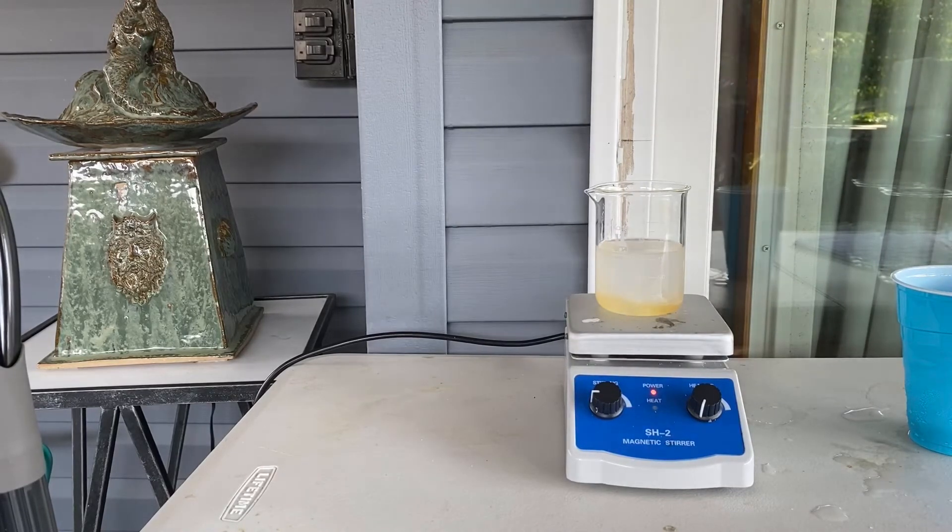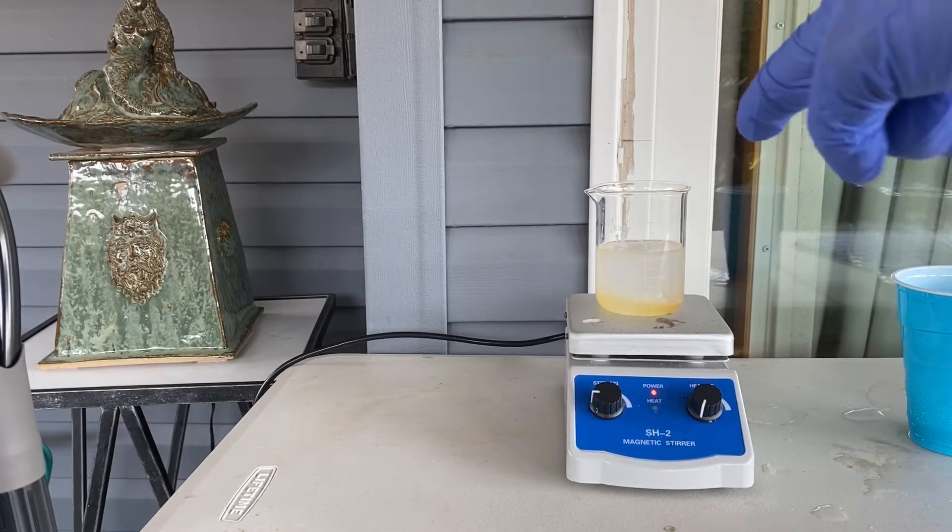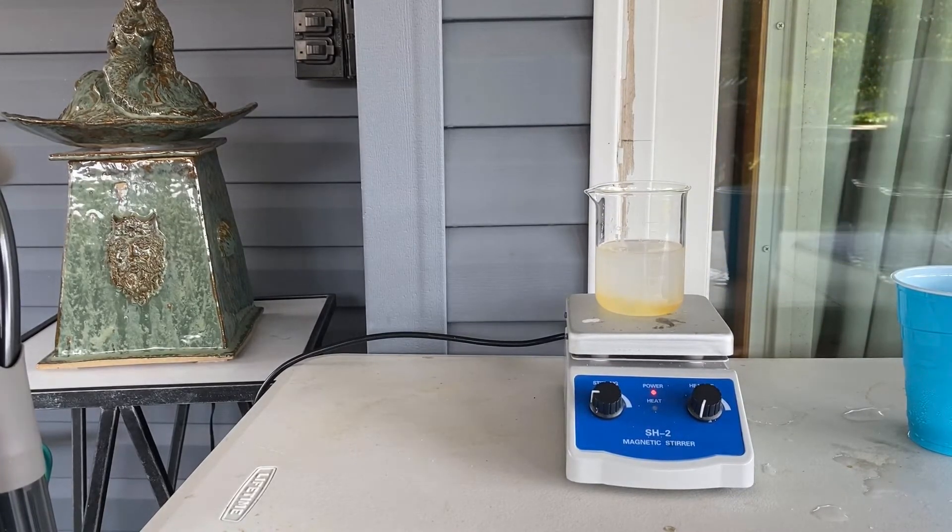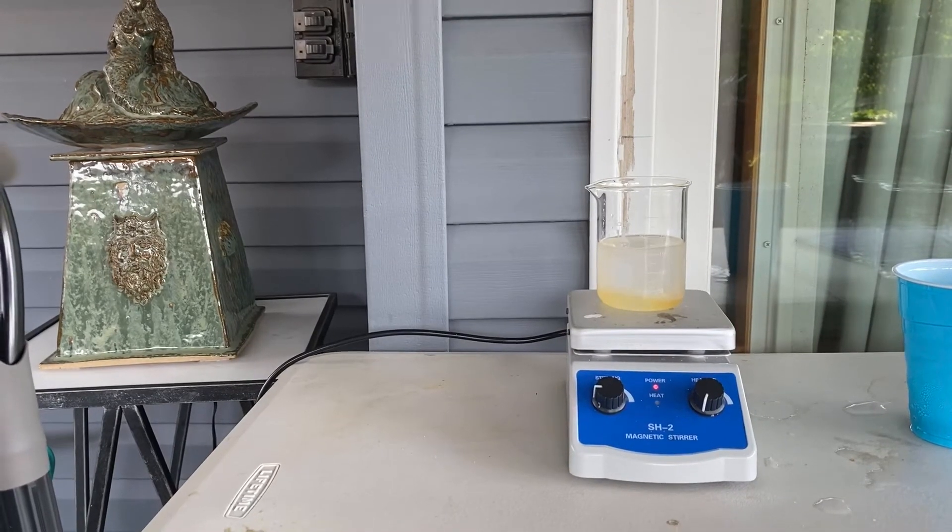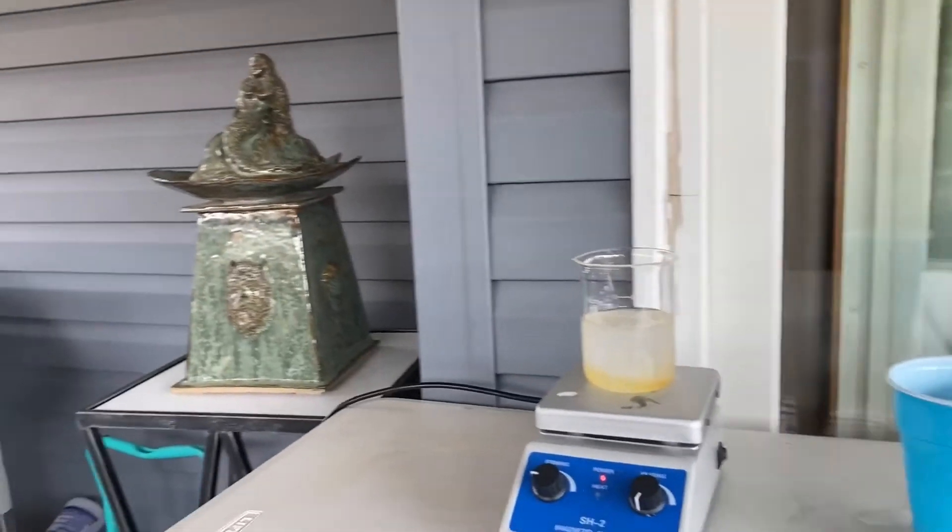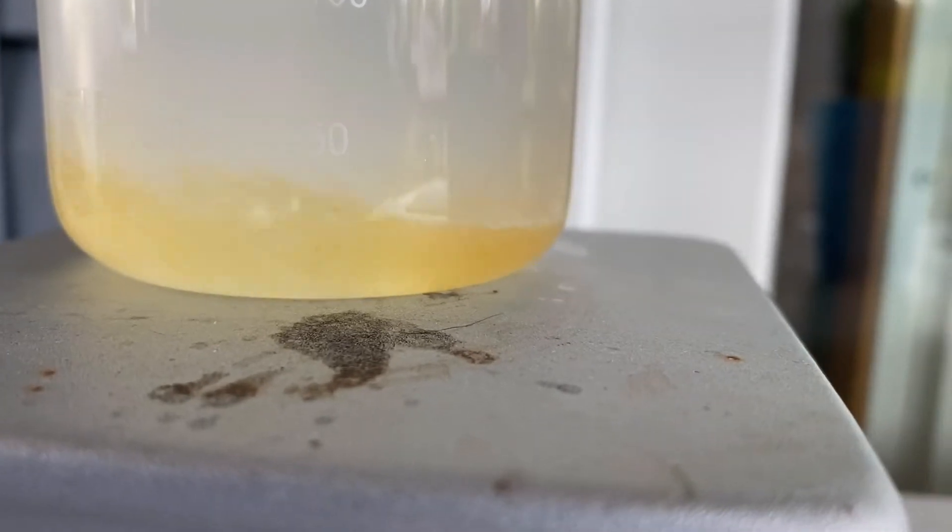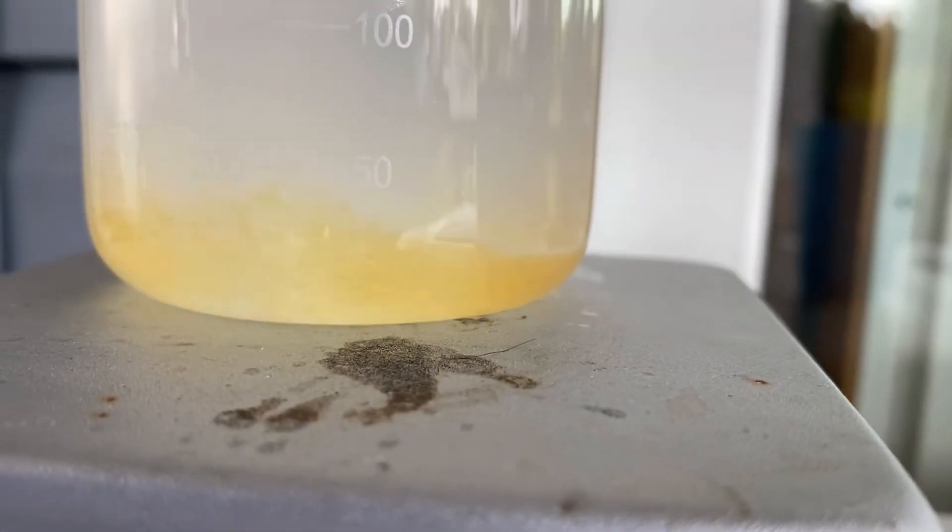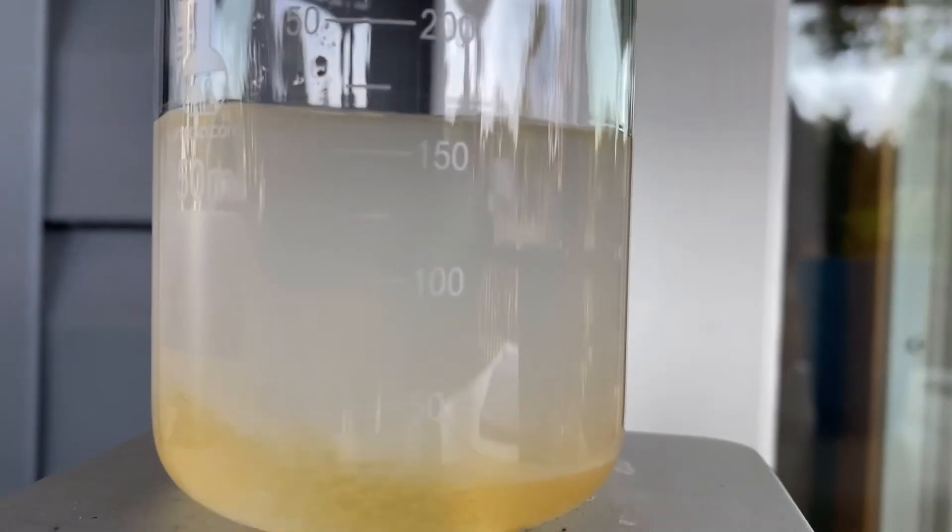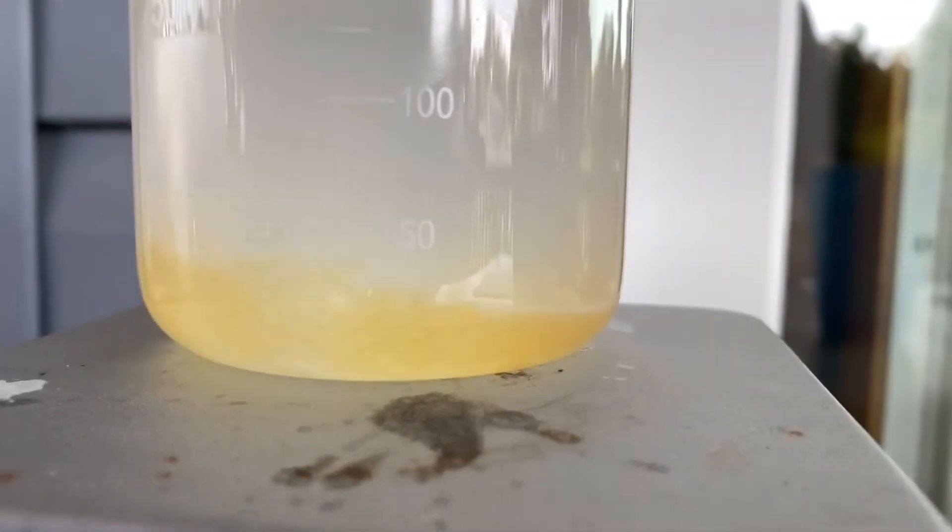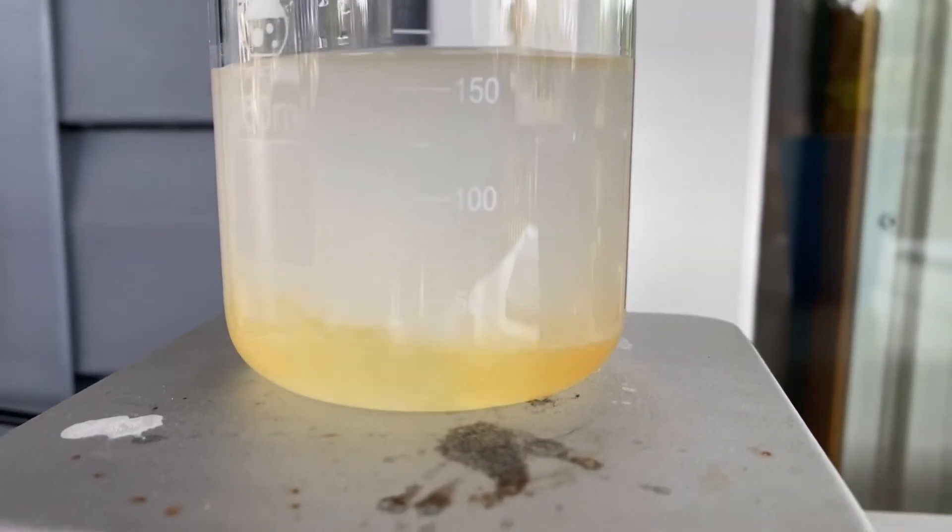So now we're going to let this stir for about 10 minutes, and then we will come back and decant the upper toluene layer. Before we go, I figured I'll just show you. As you can see, there is the sulfuric acid. As you can see, it is currently reacting with the methylthiophene and pulling it out of the toluene, which is that cloudy upper layer. So yeah, that's what's happening right now. So give it 10 minutes, and I'll be back.